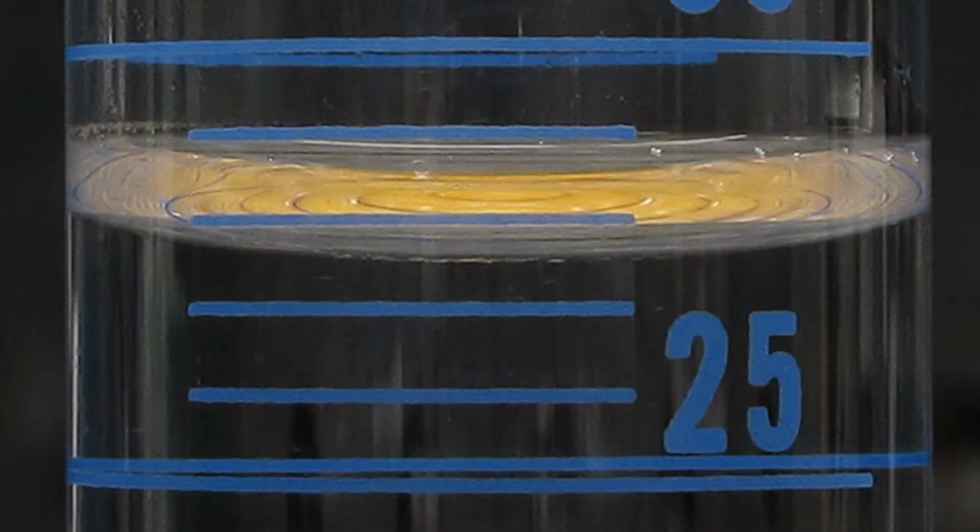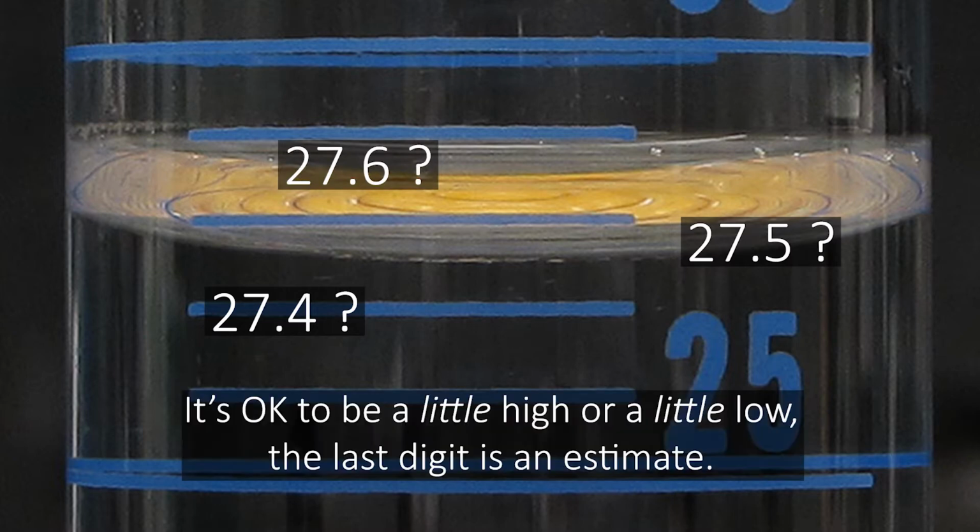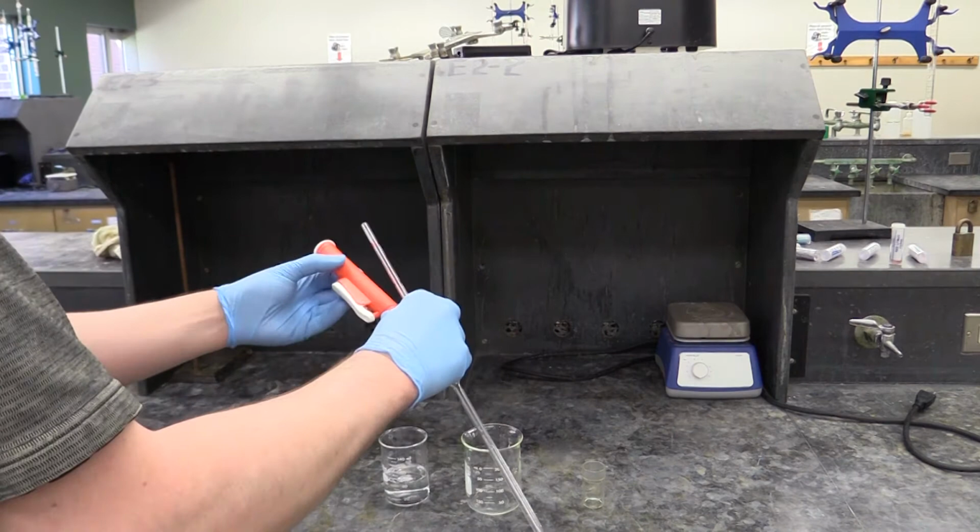If you're not used to doing this, it can sometimes be a little hard to figure out what the value of that last digit is, especially since the lines I put up on the example cylinder don't really exist. Just do the best you can, and don't worry too much if you read a little high or a little low. Interpolation is, after all, subject to interpretation. That's how you use graduated glassware.